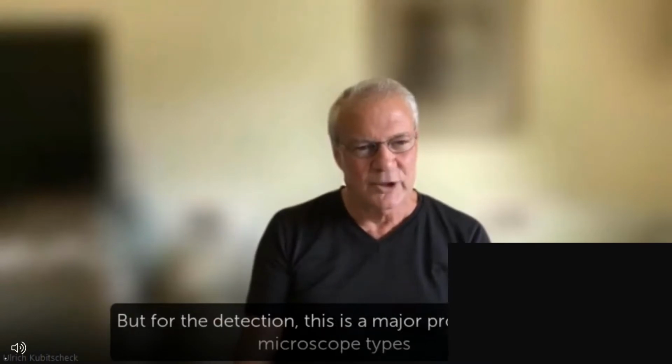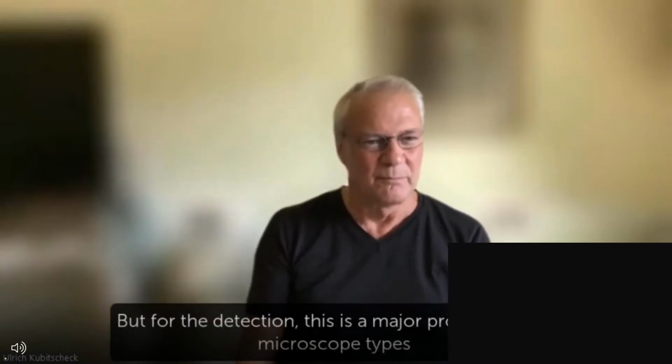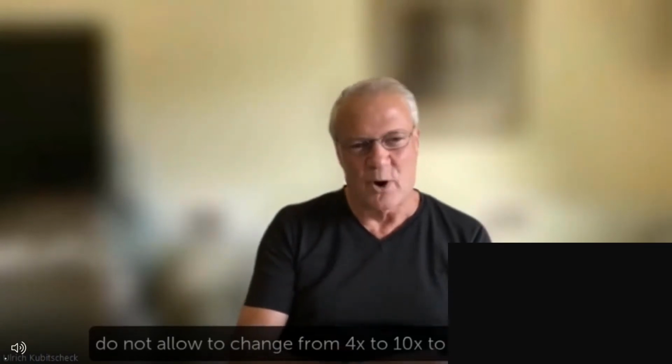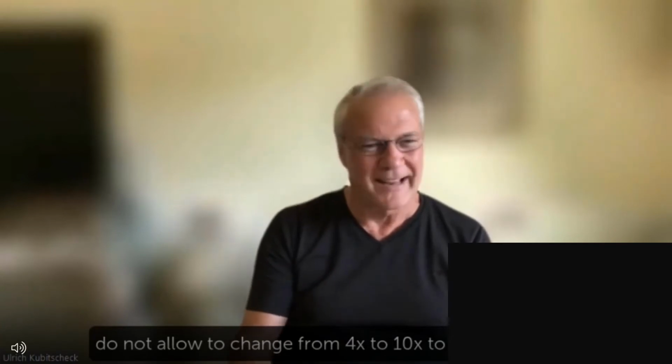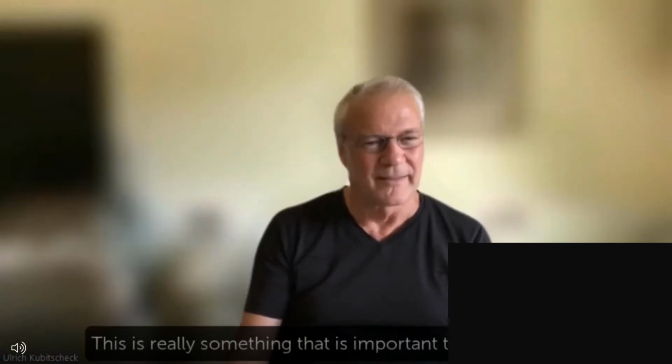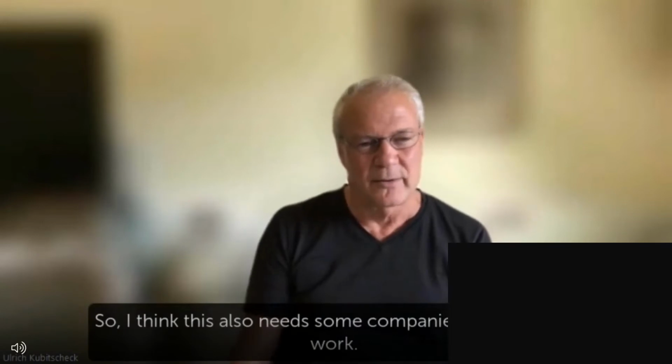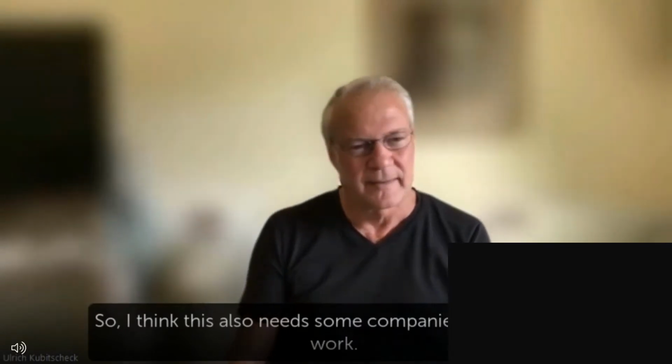But for the detection, this is a major problem. Many microscope types do not allow you to change from 4x to 10x to 40x detection. This is really something that is important to do on the fly. So I think this also needs development work from some companies.